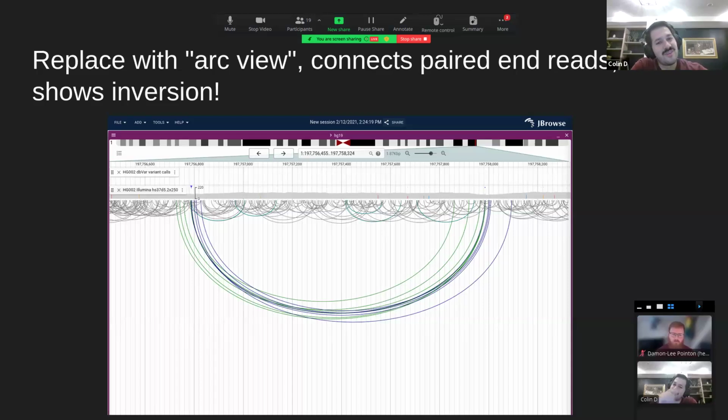So what you can tell is that there's an interesting inside out pattern, I call it. The green is on the left side, sort of on the left of this blue clipping marker, and it's on the left of this blue clipping marker. And the other one, same thing, but it's on the right. So what this indicates is that the green should get moved over here and the blue should get moved over here. And if you did that, it would flip the whole DNA sequence around.